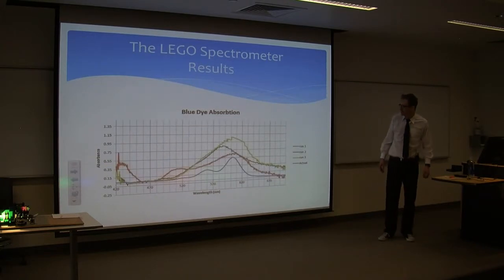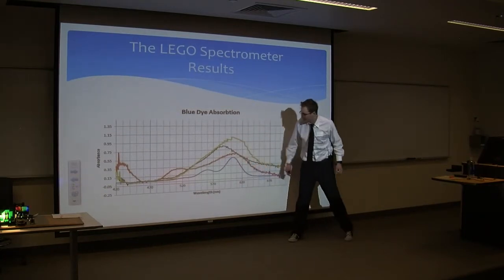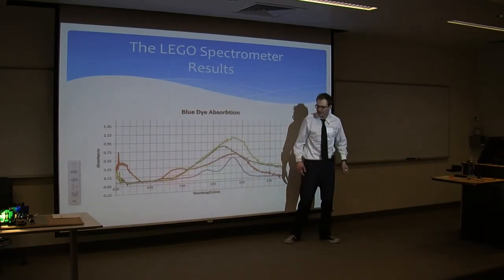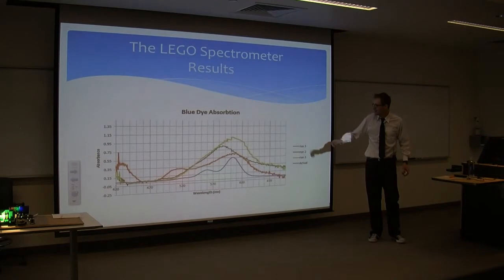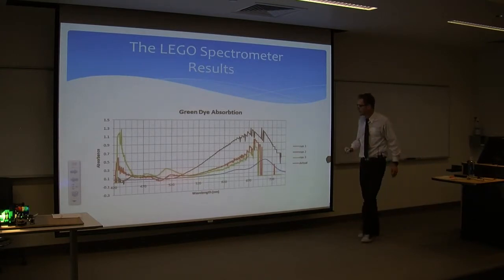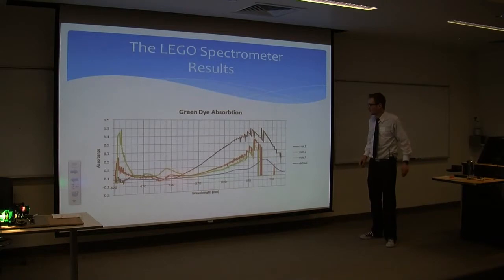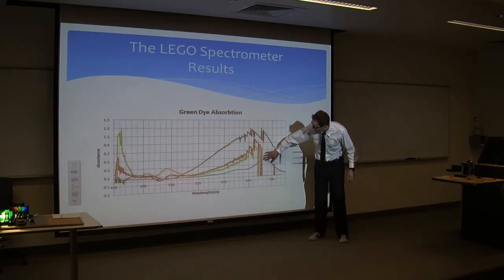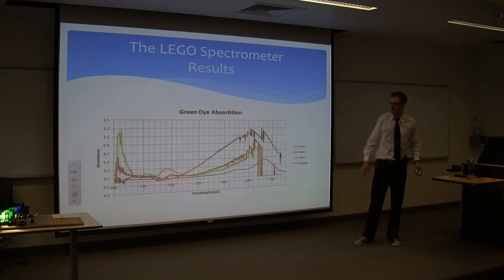Looking at the blue dye: again, the squiggly lines are my Lego spectrometer and the bottom smooth line is the commercial spectrometer. As you can see, they peak in similar areas — around 600 nanometers, which is a characteristic of blue. I was happy to see that; it looks somewhat similar, though of course there's a lot of noise. For the green dye, this would be a good example of getting too much noise in the device. Probably stray light causes those real jagged shapes. The actual spectrometer peaks around 700 nanometers. So as you can tell, this is an area to improve the device — limiting the light pollution that exists within the spectrometer.